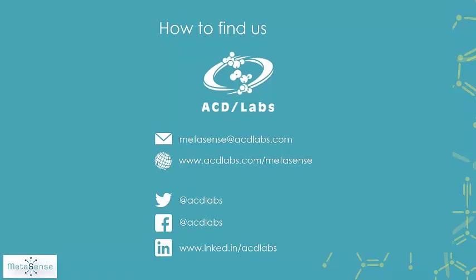Another one just came in. If you already have Spectrus Processor and then you acquire MetaSense, is there anything else that's needed to connect to the database? Everything is pretty straightforward.